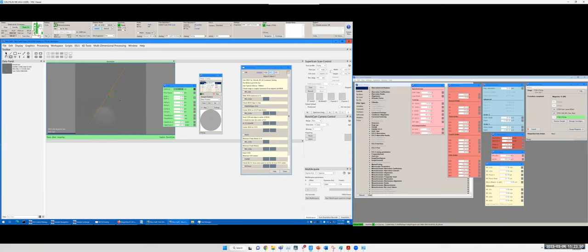So it's good to know, but usually you should not be in such bad conditions. I didn't pre-align this microscope before this training session. That's why you see it's in a very bad condition. But it's also good for this training. You have access to this additional information where I do this alignment at very, very bad conditions.